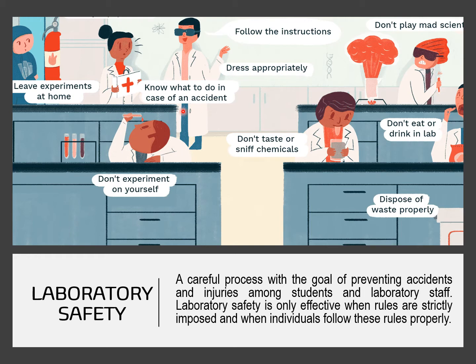If you can still remember what we discussed about our fire extinguishers, if there are accidental fires inside the laboratory, always remember the acronym PASS and RACE. Okay, and then we have dispose of waste properly. So you need to learn how to categorize the waste you are generating inside the laboratory and learn how to dispose them properly.